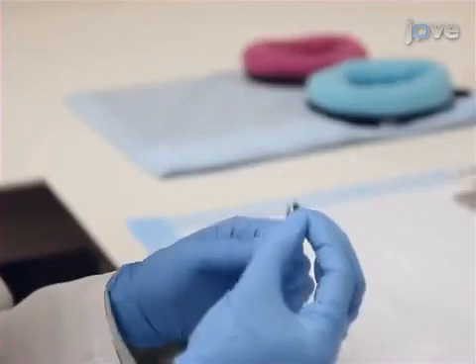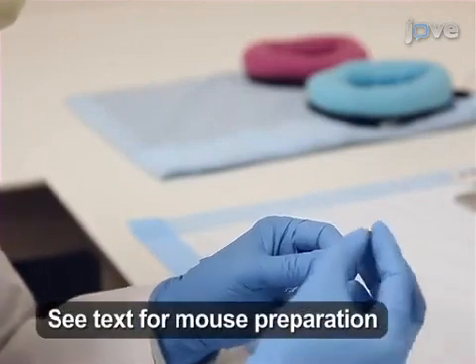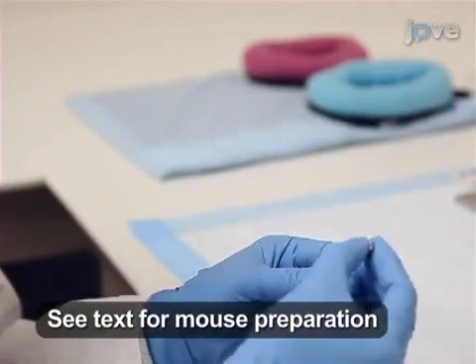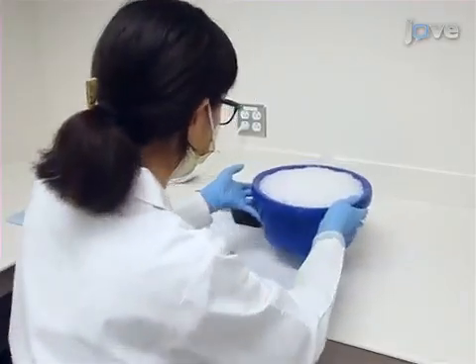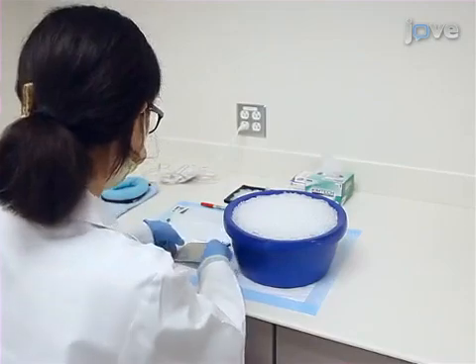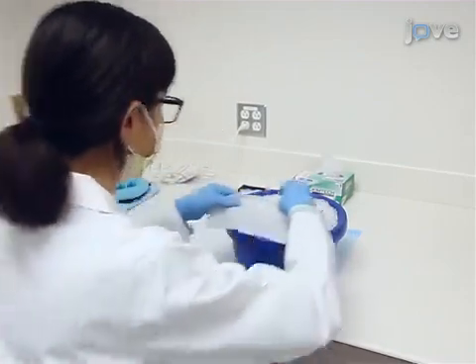To begin, prepare a 10 microlitre injection syringe with a 32-gauge needle for general postnatal day zero neonates. Then, place a small aluminum plate on ice to cool, and place a dry task wipe on top of the plate to protect the pup's skin from the cold metal.